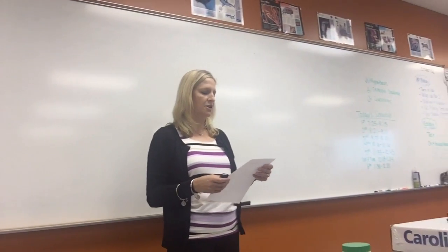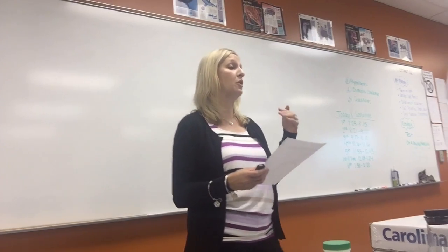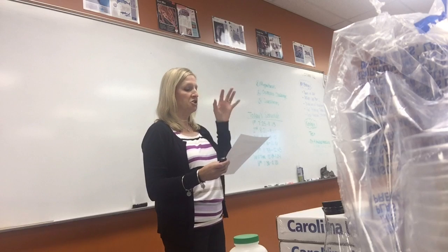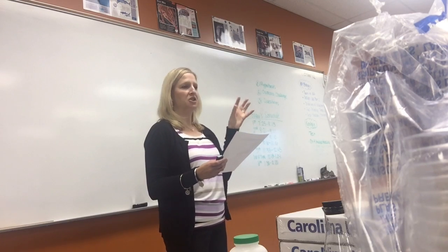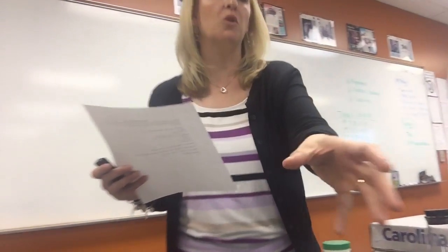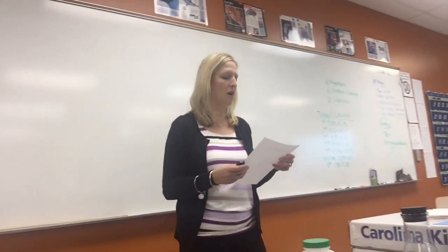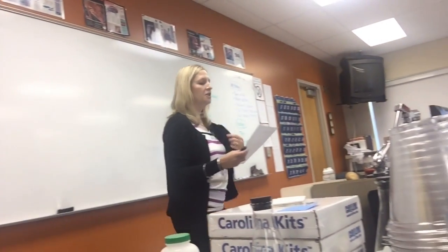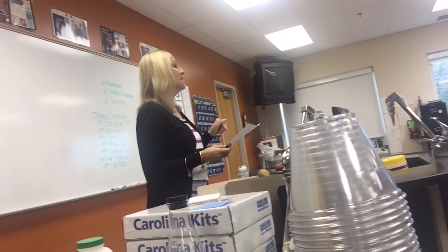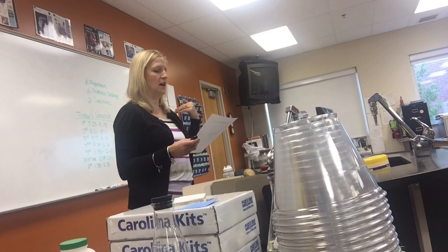With this, it says you're not going to apply this to living tissue, this meaning the information that we went over yesterday in the Osmosis Challenge and in the first lab. The tissue is composed of cells. So a tissue is a bunch of cells that perform the same function, that work together. And so we're going to look at a mass of tissue of a potato. And then what we're going to do today is design an experiment to determine the molarity of plant cells, using our knowledge based upon what we've done already.